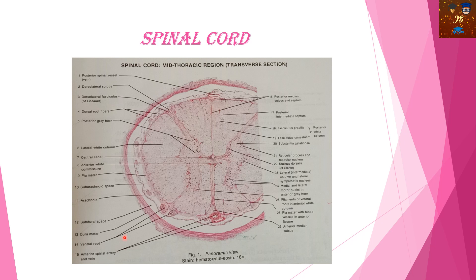Here you can see this is the mid-thoracic region of the spinal cord and it is a transverse section. The main thing to identify is the central part — this is called the central canal of the spinal cord, situated in the gray matter. You can see the gray matter is H-shaped, like capital letter H, and at the center of the gray matter you can see the central canal.